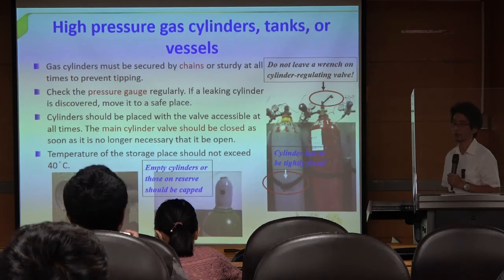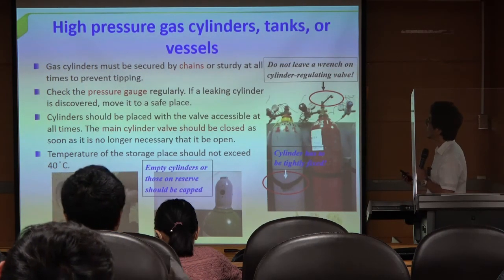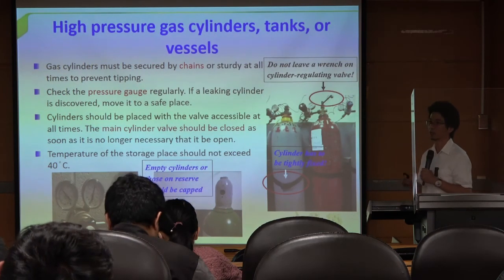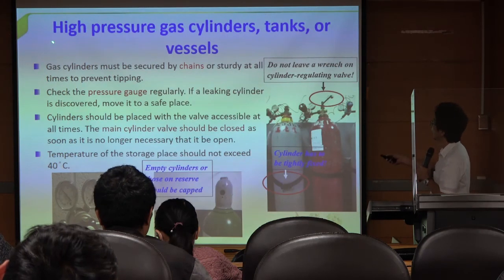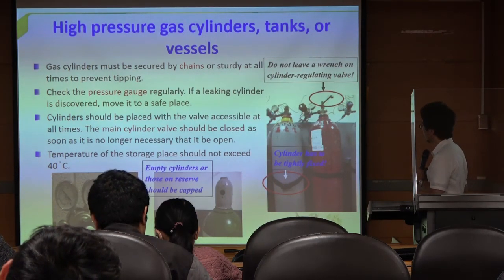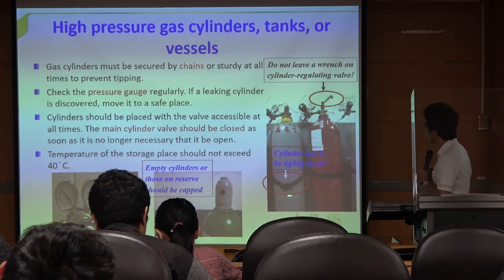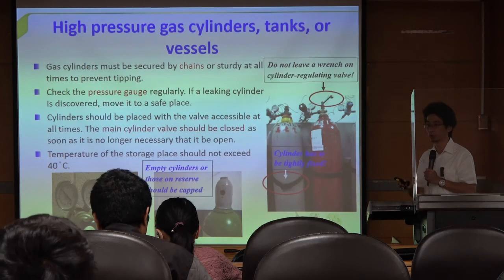I think lots of departments don't have high pressure gas cylinders. I think the chemical or chemical engineering departments will have high pressure gas cylinders. So professional suppliers will ship the cylinders to your laboratory for your use.